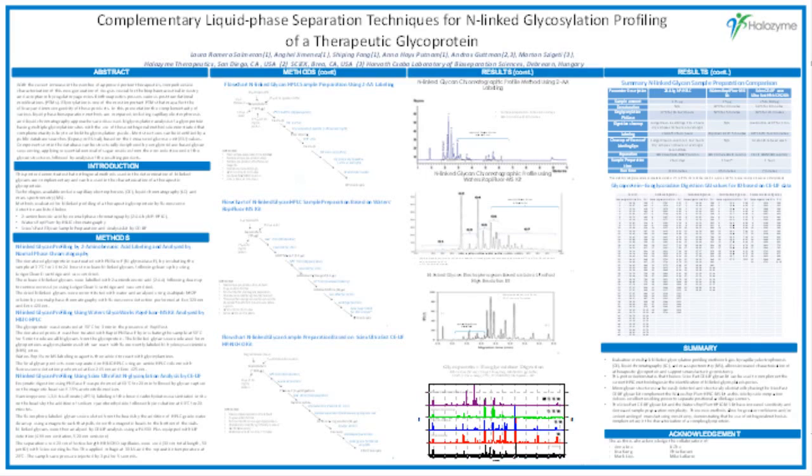And the next question is, RapiGest PNGase F was used for 2AA and RapiFluor methods. Do you know why the incubation times ranged from 16 plus hours to only 3 minutes? I really don't know. I know the RapiGest that we use for the 2AA comes in a kit as well. So probably the concentrations or what is in that RapiGest is different from one kit to another. I'm not quite sure.